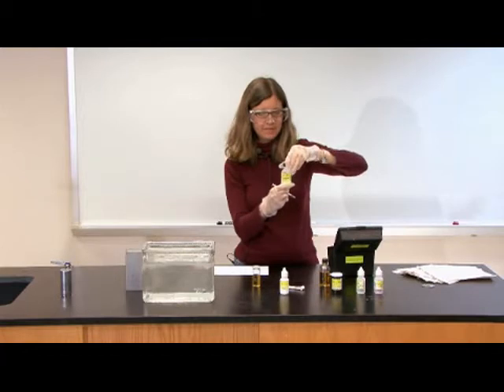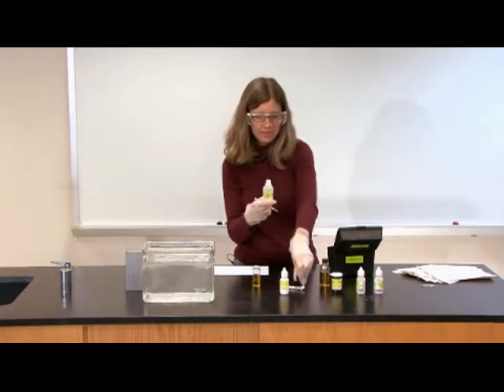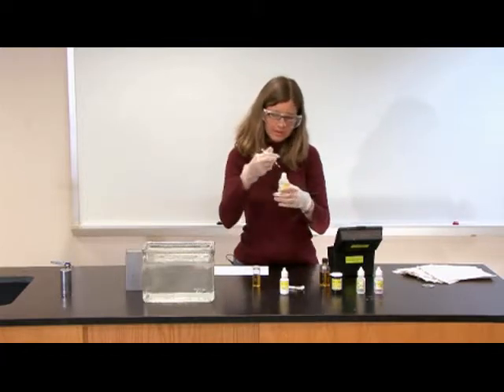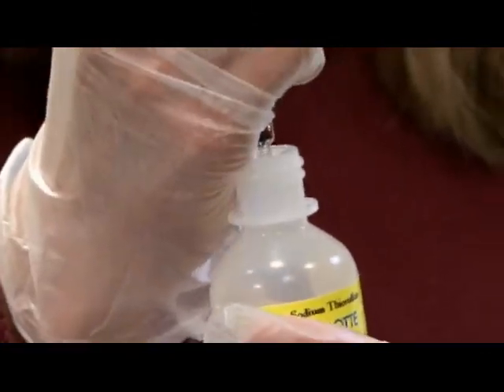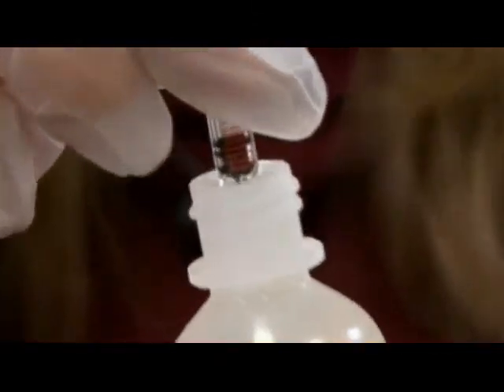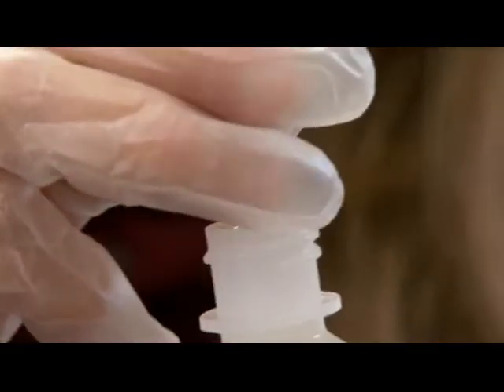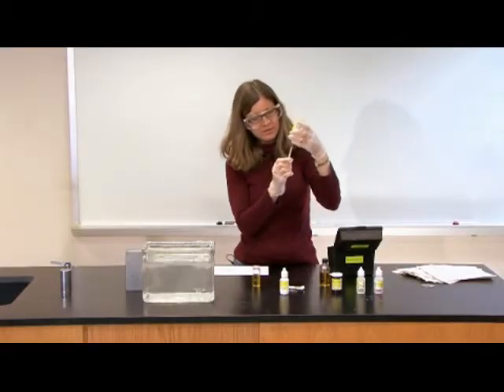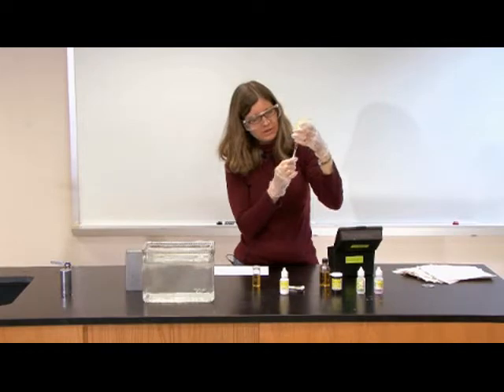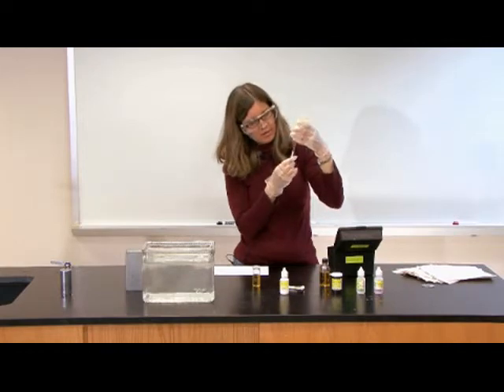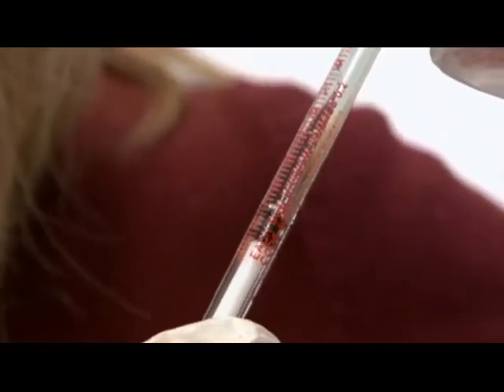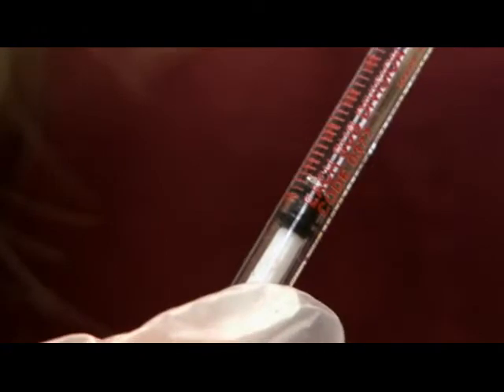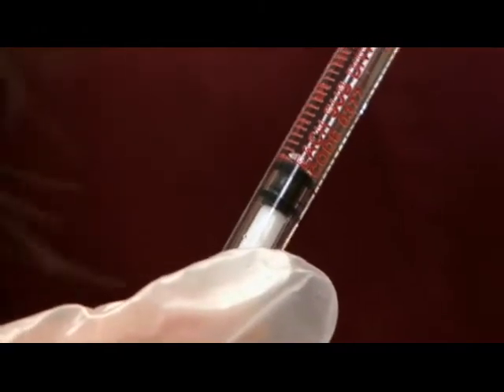And I want to collect a sample of sodium thiosulfate. So I'm going to unscrew the cap, and this bottle also has a small hole in the top, so I'll place my titrator in there, turn the bottle upside down, and slowly draw in the sample. And I want to fill it all the way full. So what that means is I want to draw it down until the bottom of my plunger is down at the zero milligrams per liter mark. So now I have my sample of sodium thiosulfate.